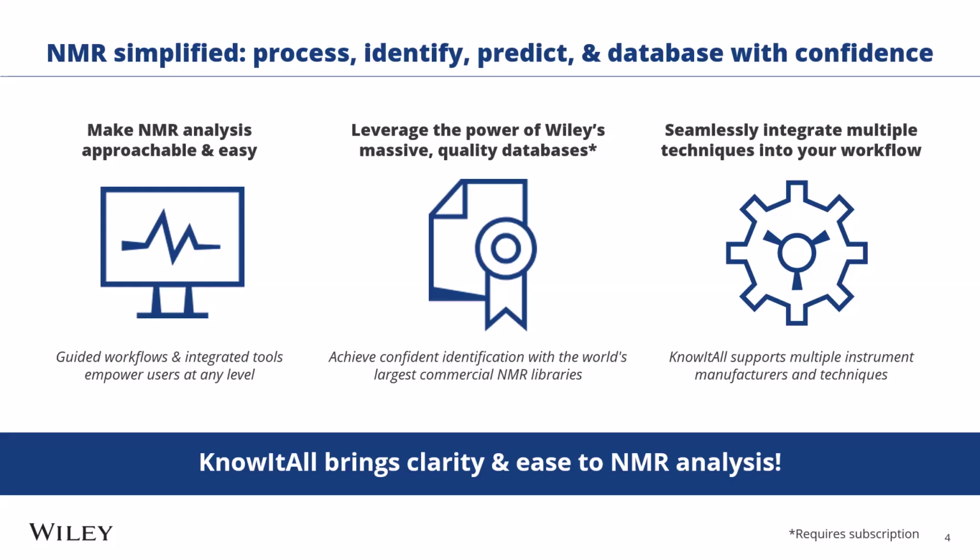In KnowItAll, we aim to make, or KnowItAll does make NMR analysis approachable and easy so that users of all levels are empowered to tackle NMR problems. And we encourage you to leverage the power of our high quality databases, which we will discuss in detail in a future slide. And of course, reminding you that this software is multi-technique so that you can support multiple instruments and techniques in one interface.